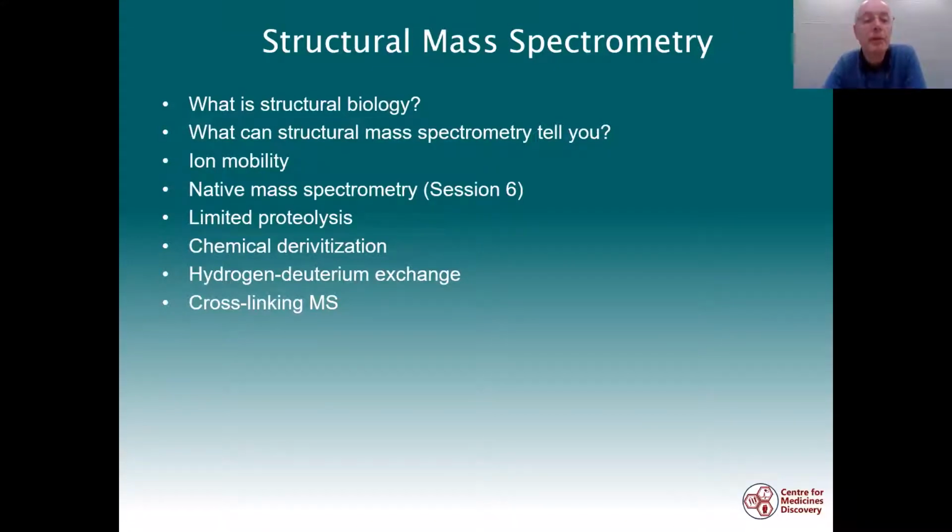I'm also going to talk about limited proteolysis, some structural information you can get from chemical derivatisation, hydrogen-deuterium exchange, which is a very powerful technique, and also cross-linking mass spec.